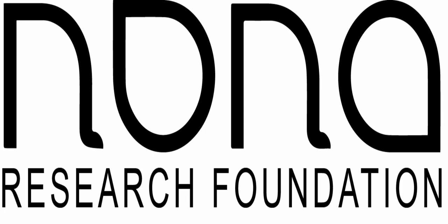If you're not too familiar with LIMS, in my perspective, and a lot of people say, there are about eight different integrations you're going to have. There's going to be workflows, workflow planning and execution tools. There's going to be data infrastructure management, some actual instrument interfacing tools like lab automation. There's going to be some sort of data analytics, so you can come back and look at all the samples and see where things are going right or where they're going wrong, along with some compliance management.